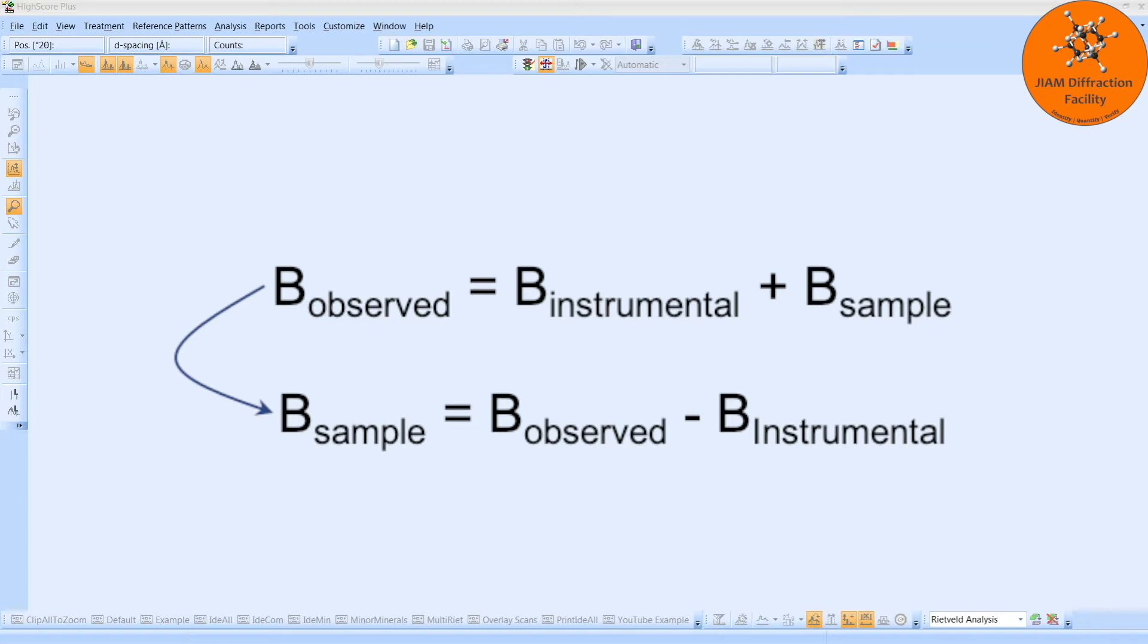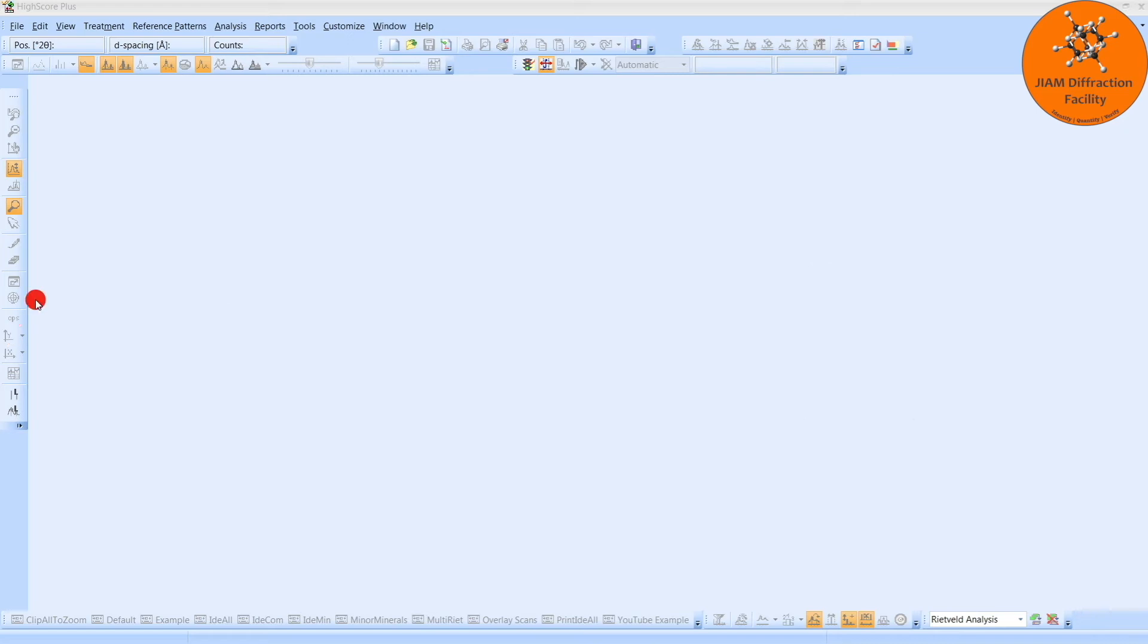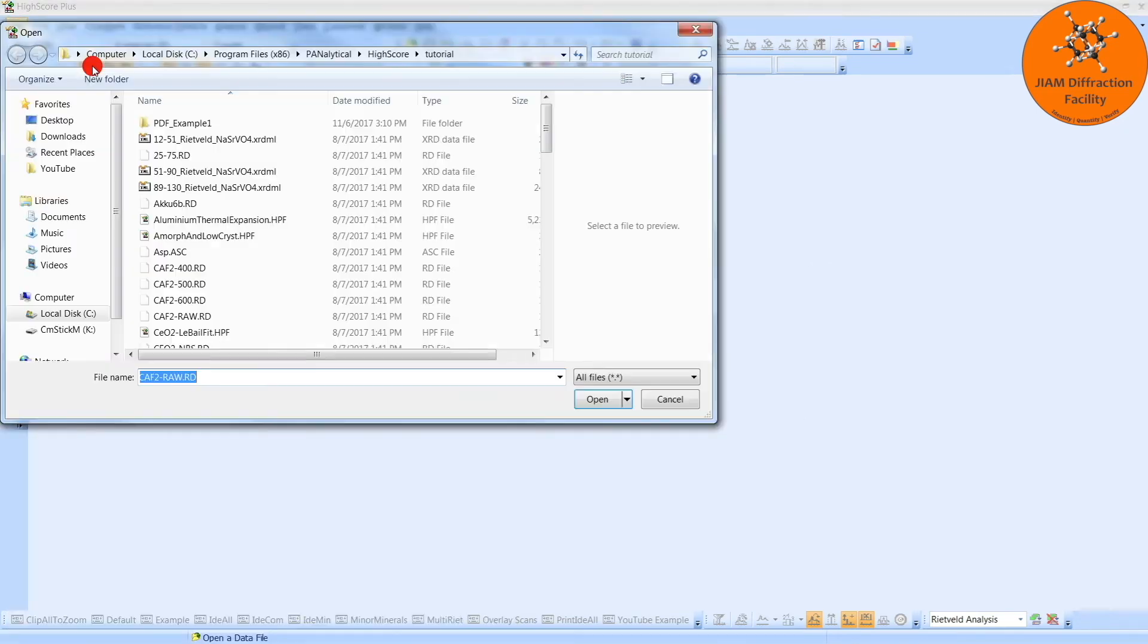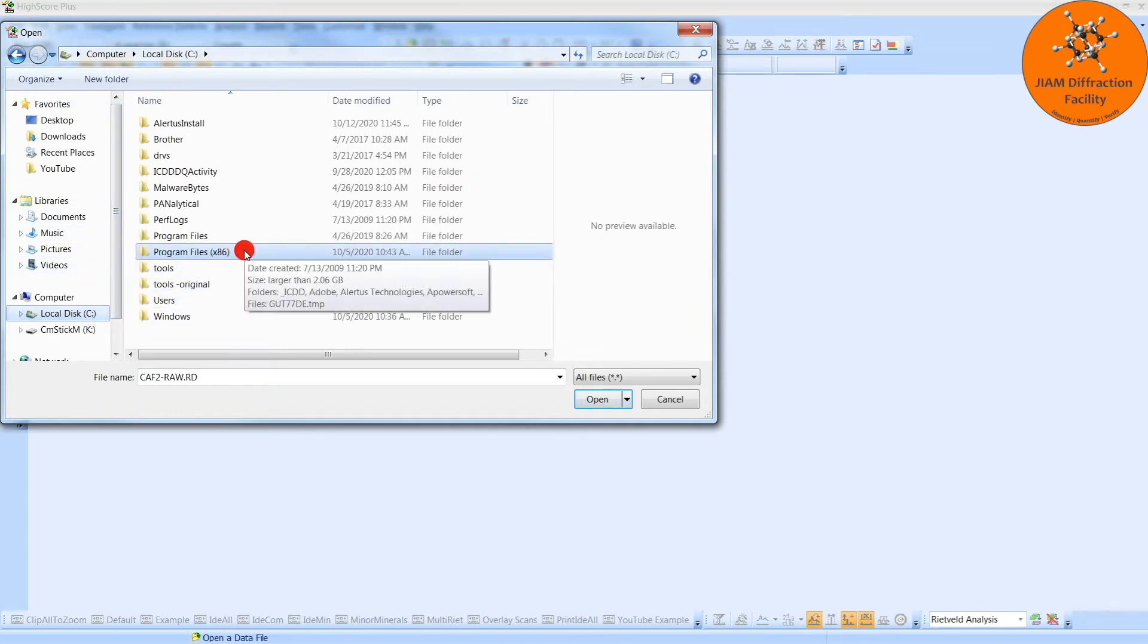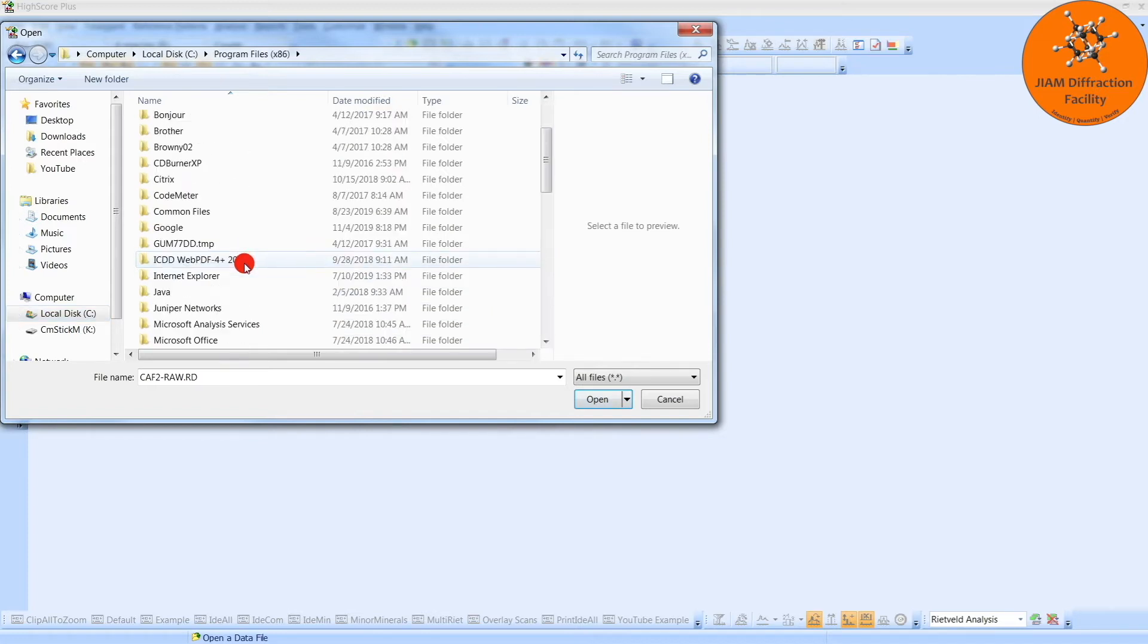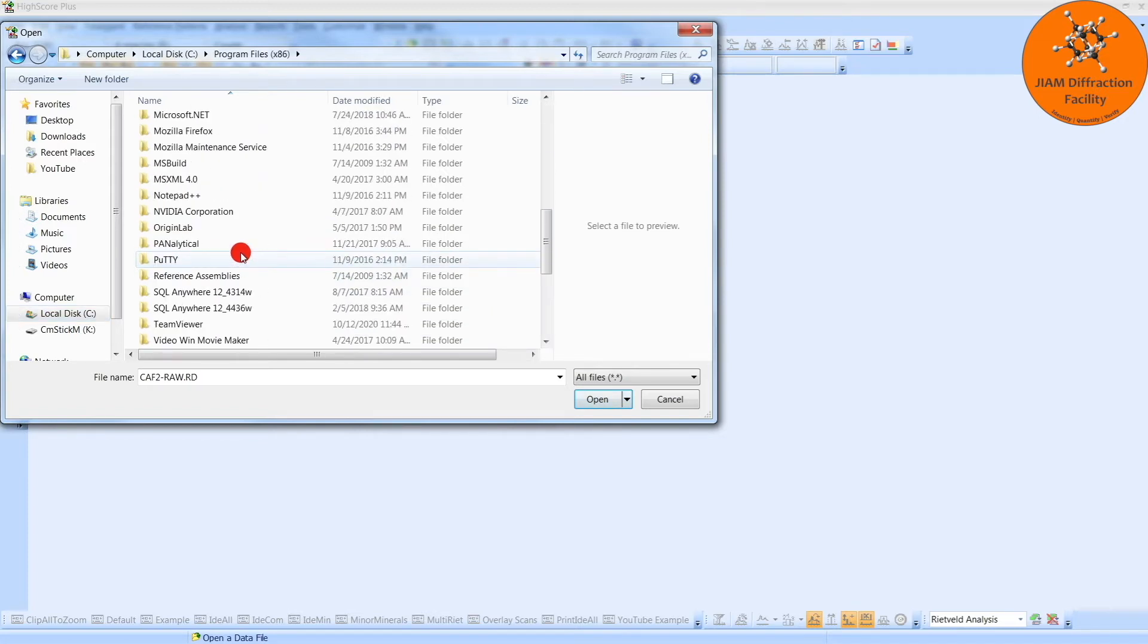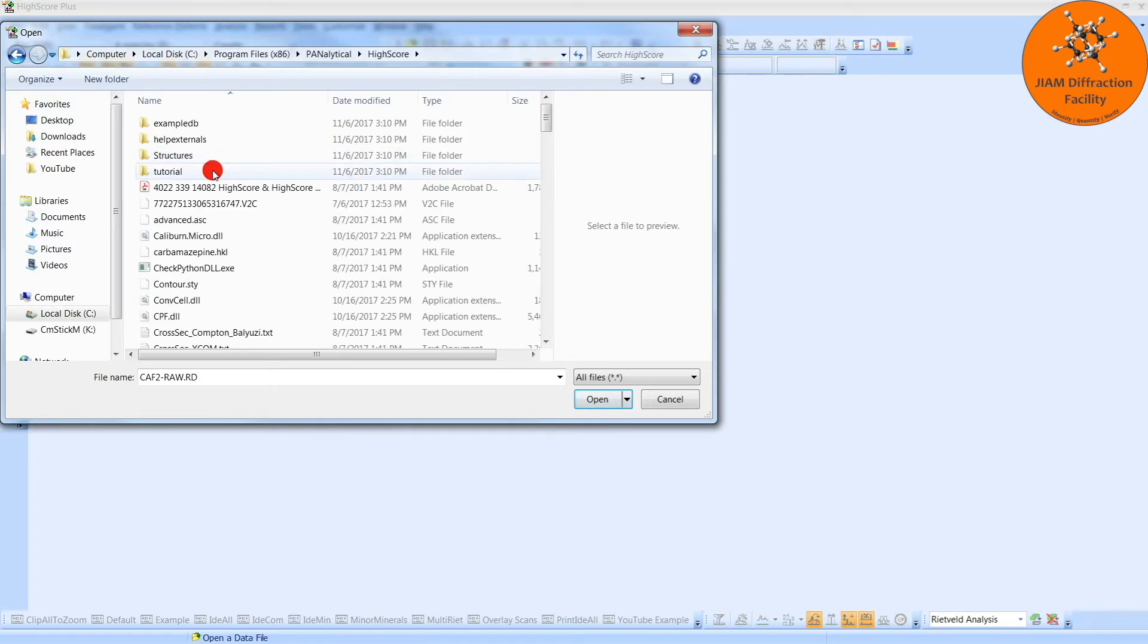We will need to start by opening our diffraction pattern from the standard. So we go to File, Open, go to the Local Disk C, Program Files x86, scroll down to Panalytical, HighScore, and Tutorial.